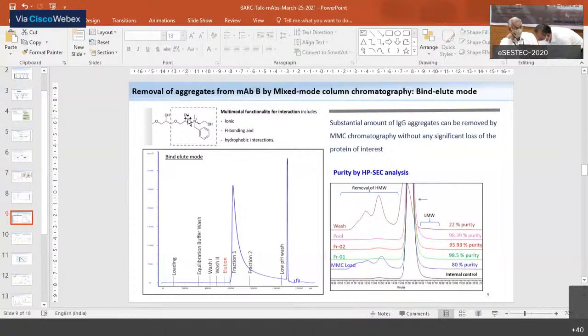Professor, we would like to know whether this ion exchange works in the reverse phase mode. Yes, this is okay. Now, when you say reverse phase here, normally for aqueous chromatography, you don't call it reverse phase. You actually use partition coefficient. That means this chromatography will allow you to purify protein at higher salt concentration. And at higher salt concentration, the protein hydrophobic patches will get clustered without hampering the native structure, and then they can bind to the hydrophobic ligands of the chromatography system. So I would not call it reverse phase. I will say hydrophobic interaction. If you have to use reverse phase, you have to use organic solvent, and in the process you will denature the protein. So normally we don't use reverse phase for protein purification.